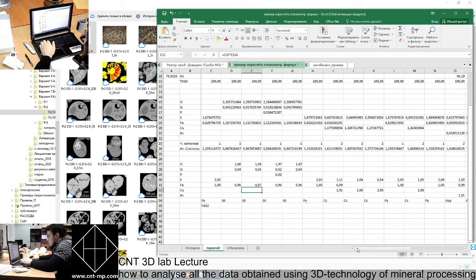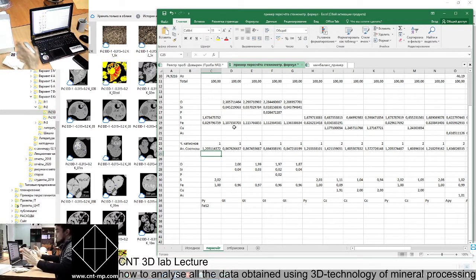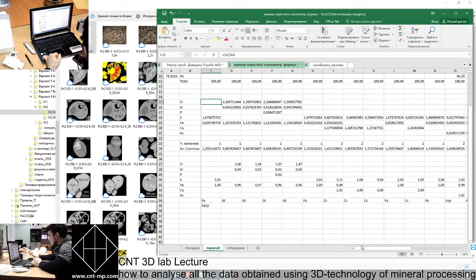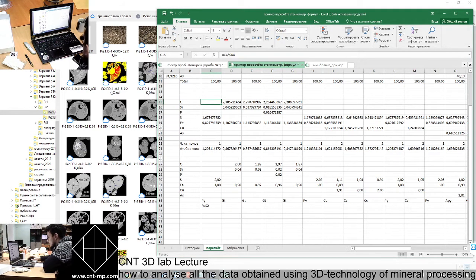Also, I have to mention that there are two common anions which are excluded in counting of atomic ratio, sulfur and oxygen, as they almost always stay in the position of anions in a crystal cell.